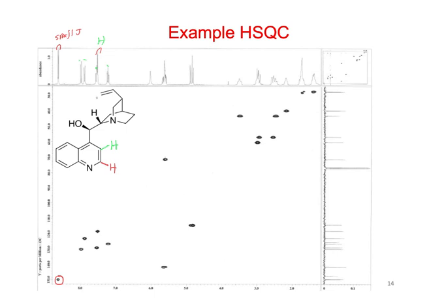In here, so the next, let's see here. These are all aromatics here. No, aromatics and double bonds. So these two are these two, I believe.